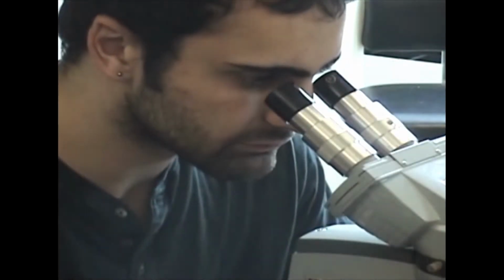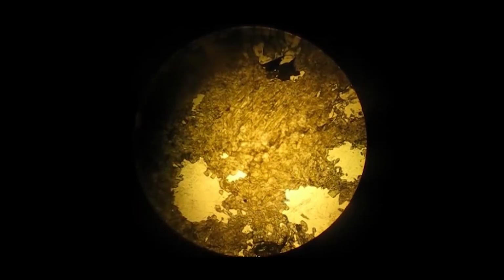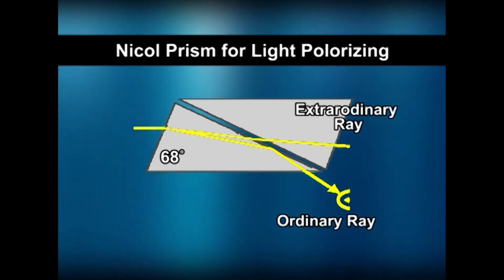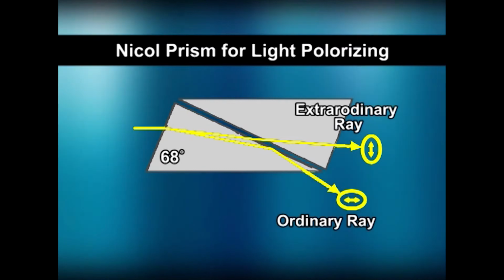Petrological microscope is a type of microscope used in the study of thin sections of minerals and rocks. It differs essentially from an ordinary biological microscope in having a revolving and graduated stage and two Nicol prisms, one below the stage and the other above it. Nicol prisms serve the purpose of converting ordinary light into polarized light suitable for the determination of optical properties of minerals. A petrological microscope is therefore called a polarizing microscope. There are several makes of petrological microscopes.